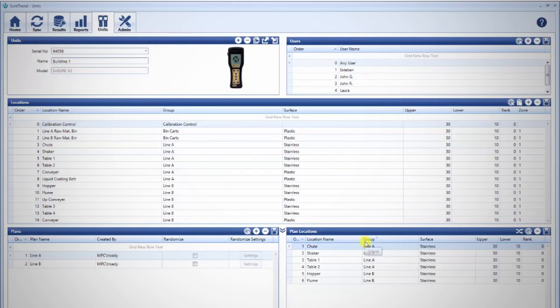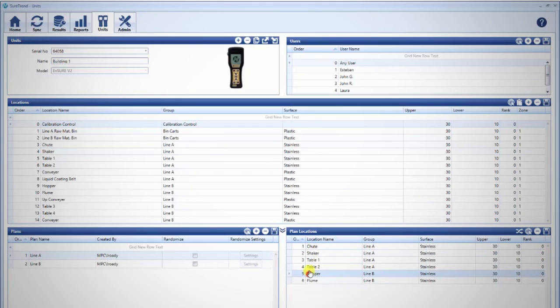Now you may rearrange the order in which the locations will appear in the plan by clicking, holding, and dragging rows to the desired position.